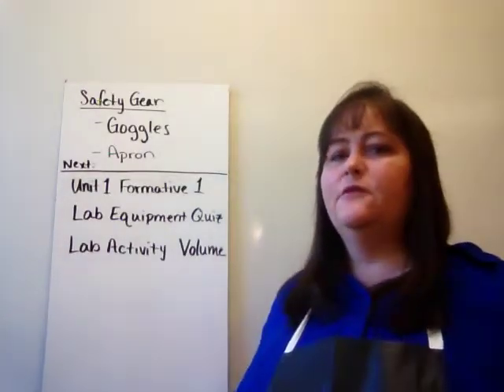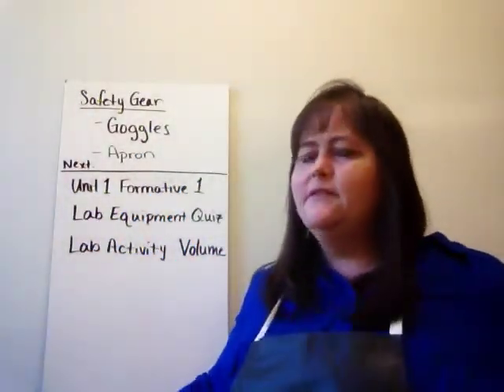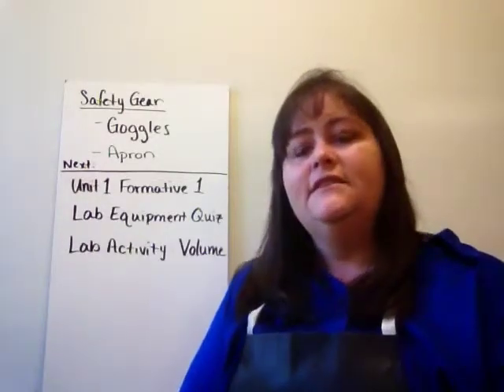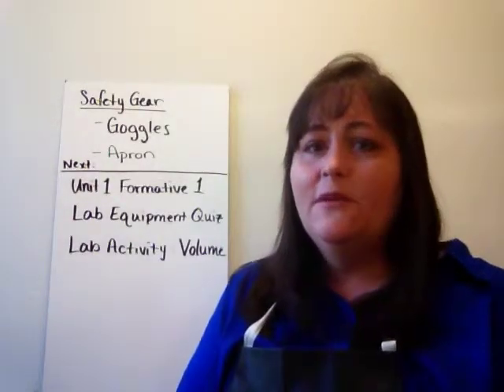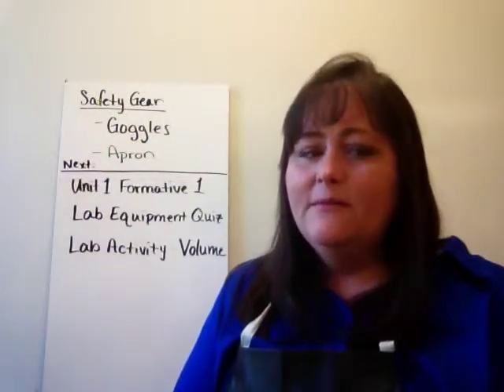And the last piece of equipment is this gorgeous lab apron. Don't you want to wear one of these? Make you look so gorgeous, like you have all the fashion sense in the world. Unfortunately, you will have to wear them from time to time. When you do wear them, you need to keep them on.